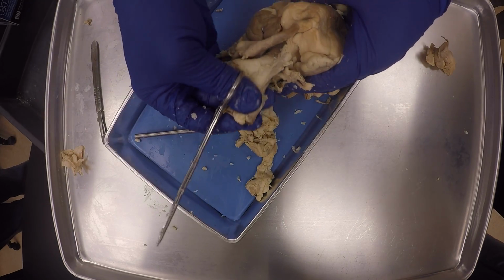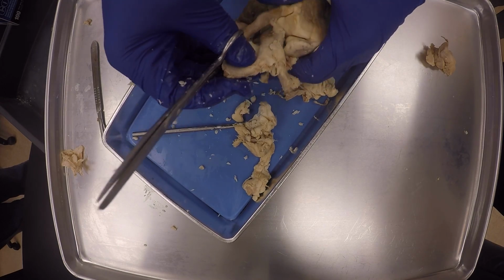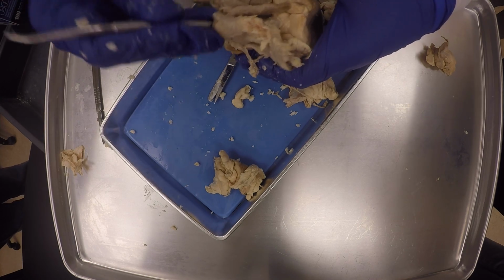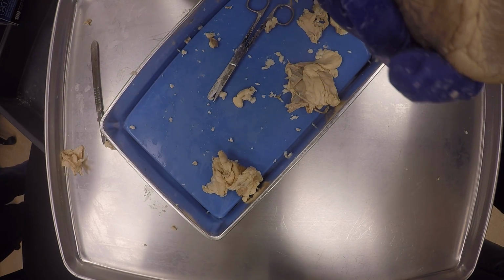Because they're both arteries. So this is the brachiocephalic trunk, and this is the aorta. You see, and you can see the arc doing like that. So if I was to put my dowel through here, you see, it's going to go to the left side.